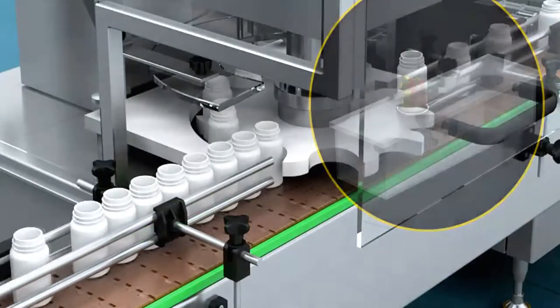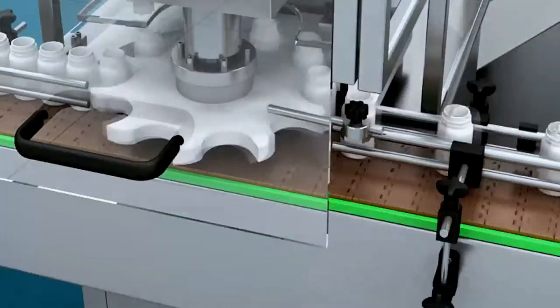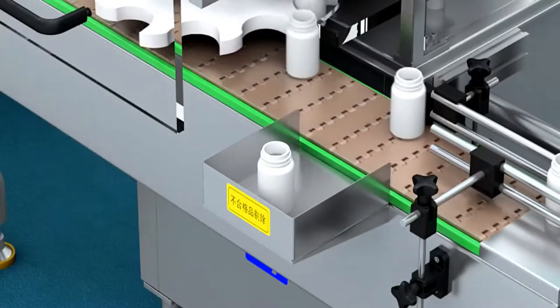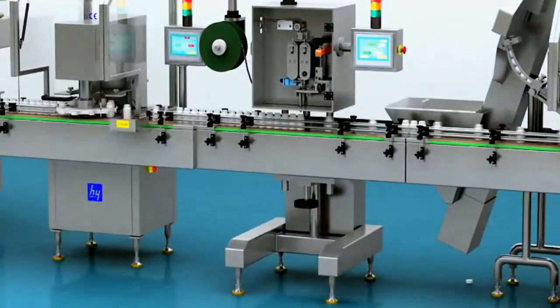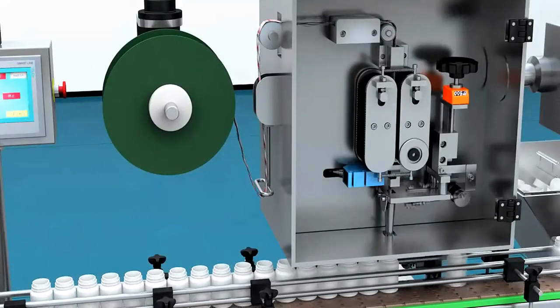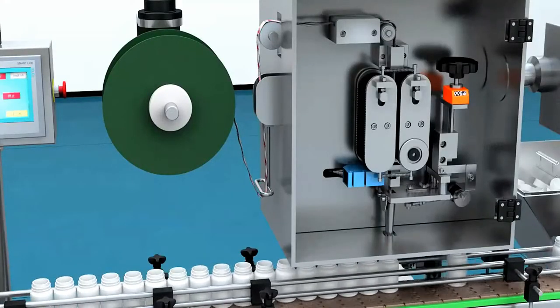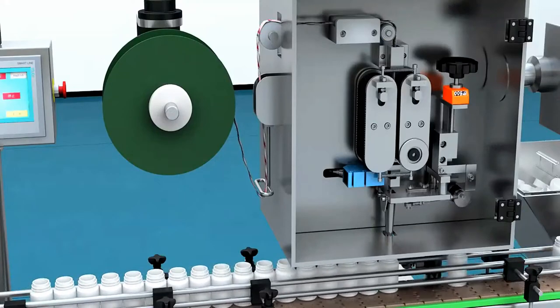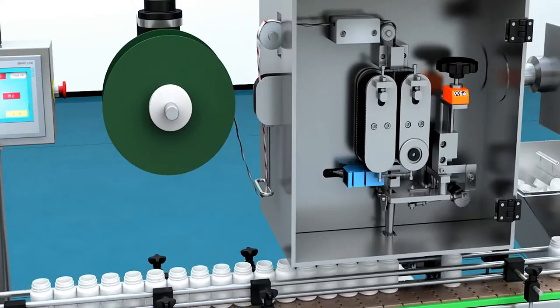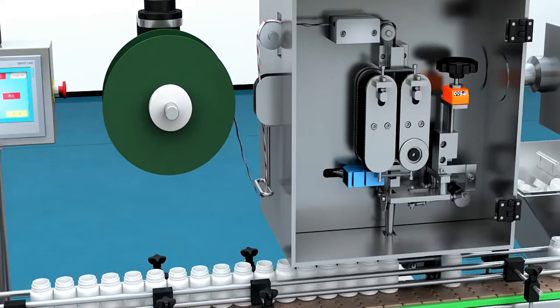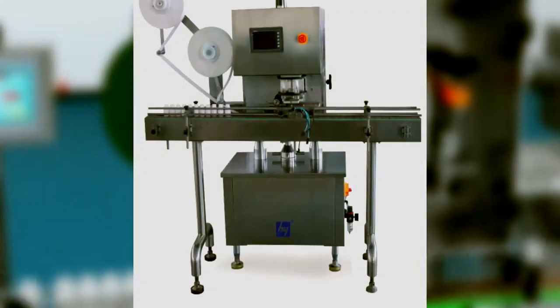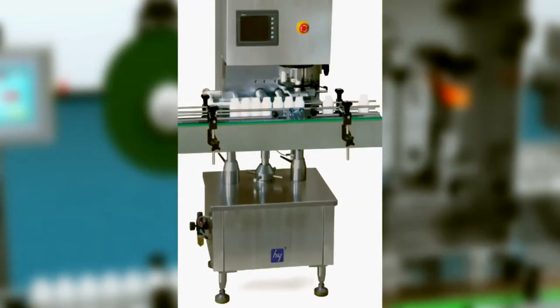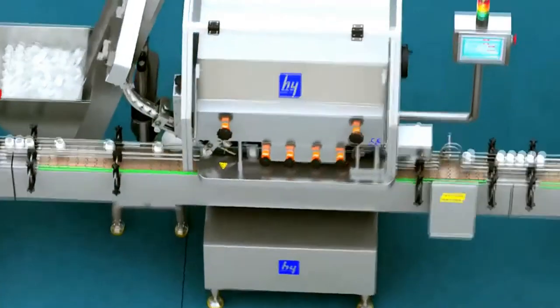This avoids the weight differences of empty bottles from influencing detection accuracy and guarantees the accuracy of medicine weights in the bottles. It can avoid shortage and overage for products in each bottle with accuracy reaching positive and negative 30 mg, guaranteeing packing qualities to be 100% qualified.